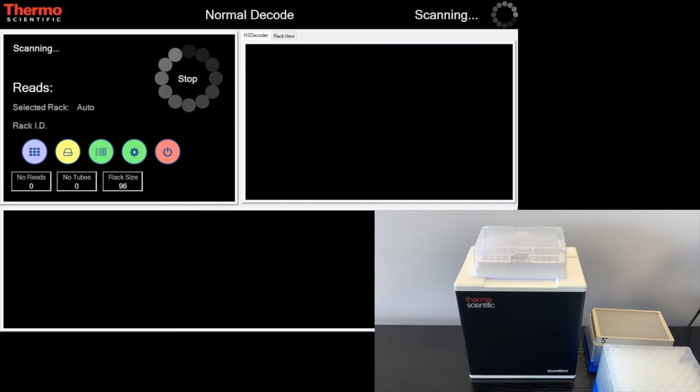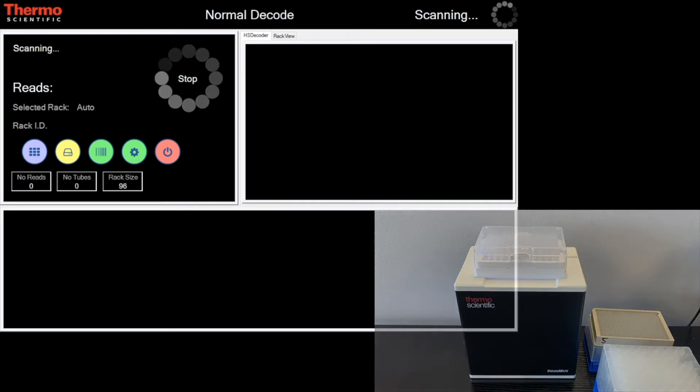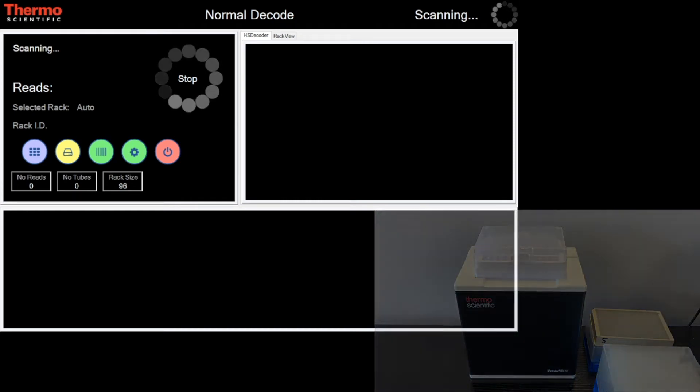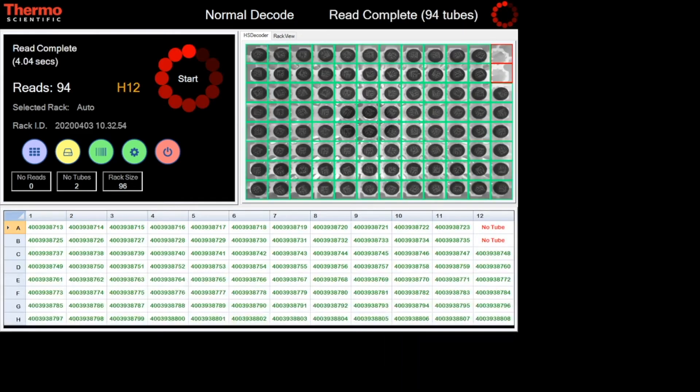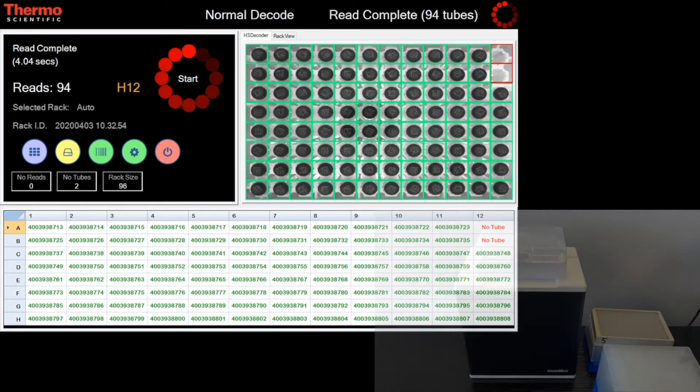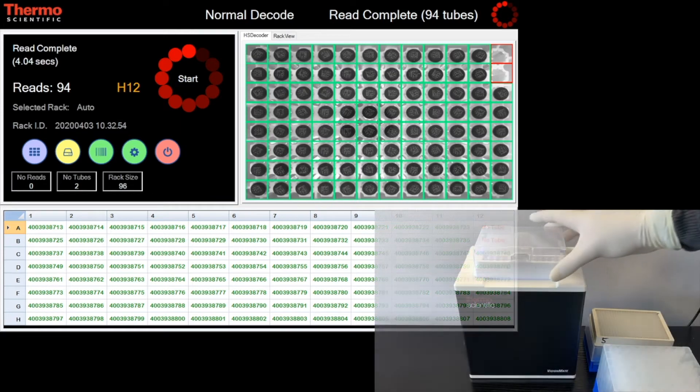The Visionmate range read all format racks, size, configuration and manufacturer.